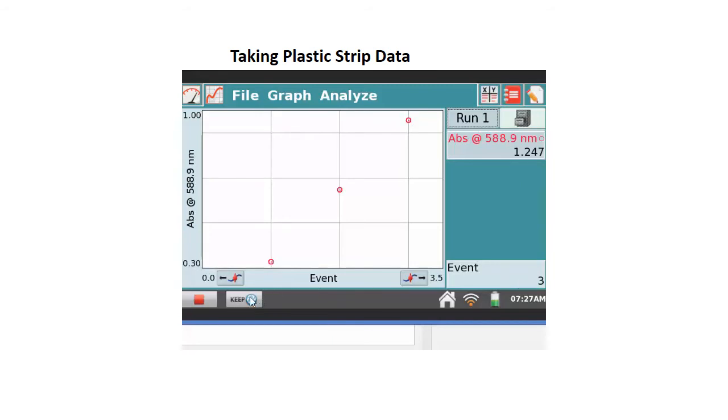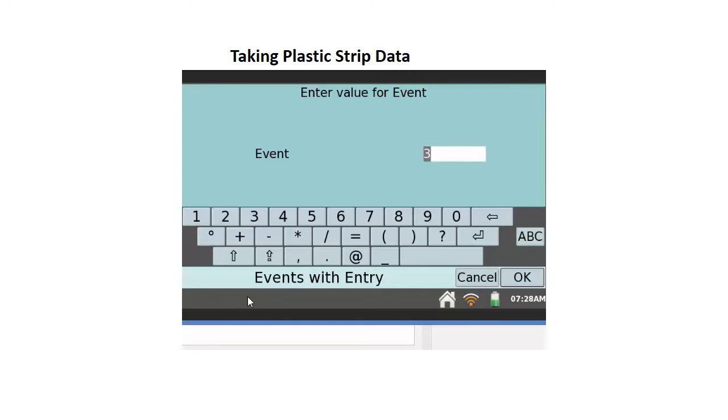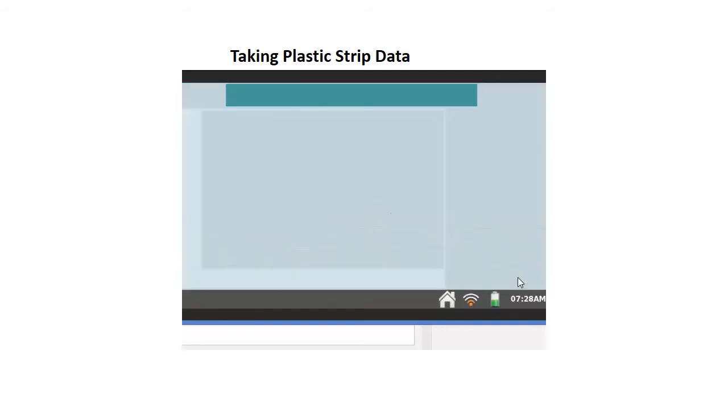And we'll go ahead and tell it to keep this one and let it go for 10 seconds again. And we'll put in a 4. Tell it OK.